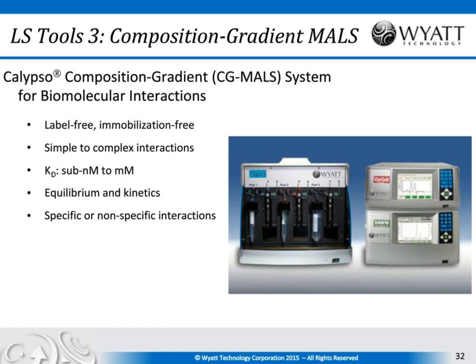Because it is a first principles technique, it can characterize both simple and very complex interactions, with a wide range of KDs from sub-nanomolars to millimolars. Typically we use it to look at equilibrium, but it is a stop flow technique and can be used to assess kinetics, but not very fast kinetics, kinetics on the orders of seconds and longer. And typically it can be used to characterize both specific interactions and the non-specific intermolecular interactions that are important in understanding stability in formulations.